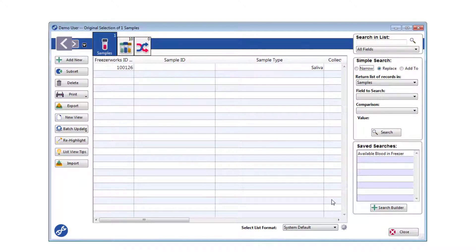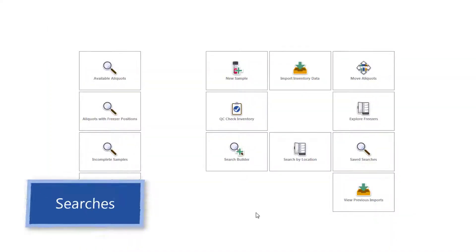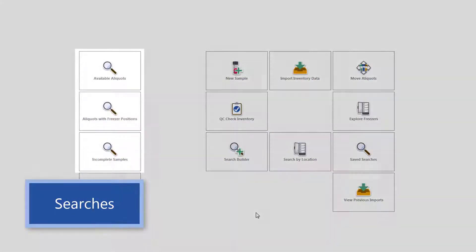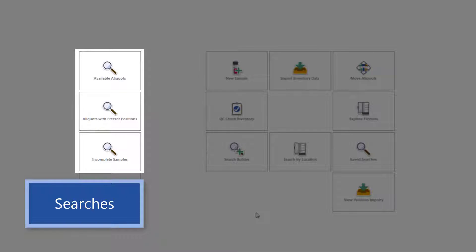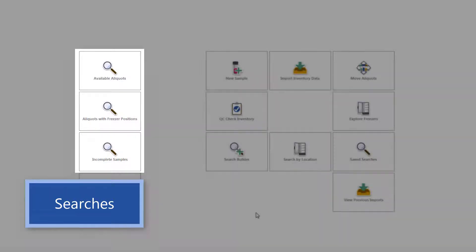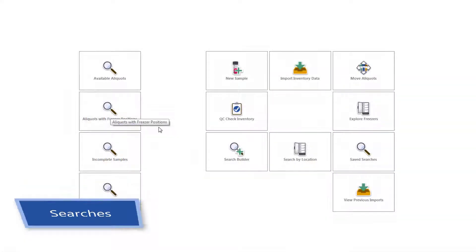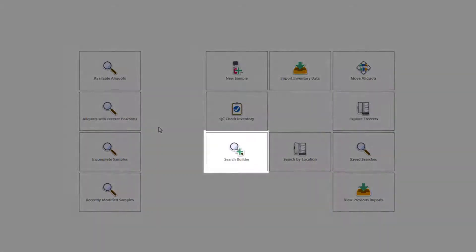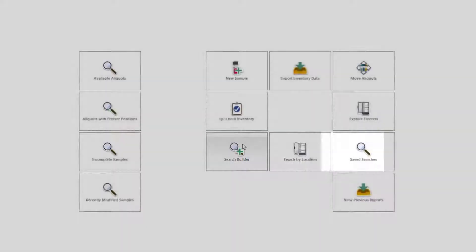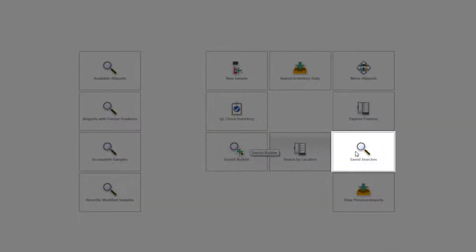Return to the homepage now, and let's talk about searching. On the homepage, we've provided saved searches, as I said before. You can start with one of these, or create one of your own, by clicking the Search Builder or Save Searches tile.